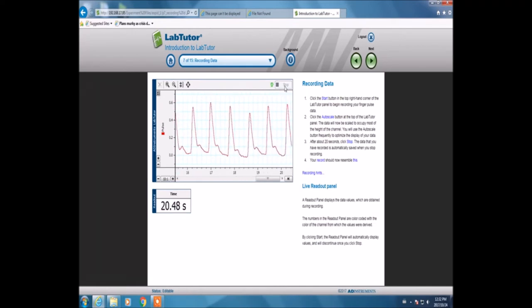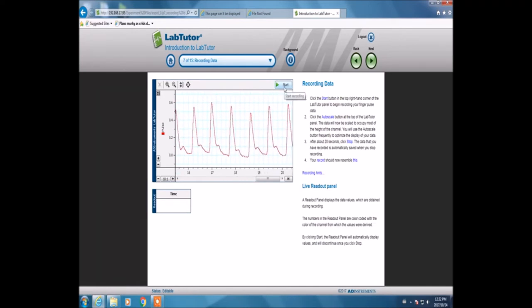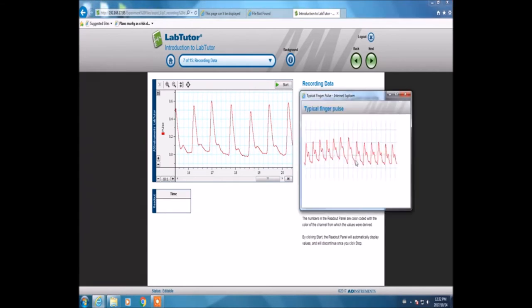Over here, close to the bottom in the last paragraph, in the last sentence, there's an option to press. It gives an example of how the graph should look. If it looks like this, then it's correct.